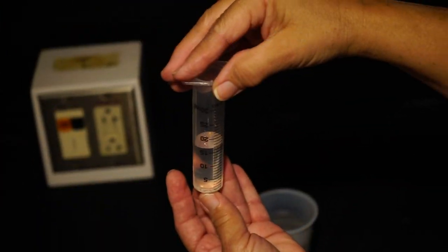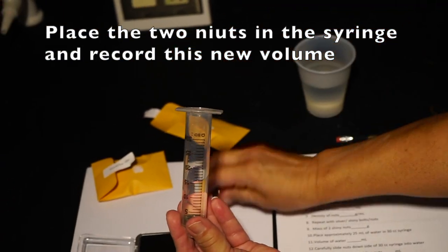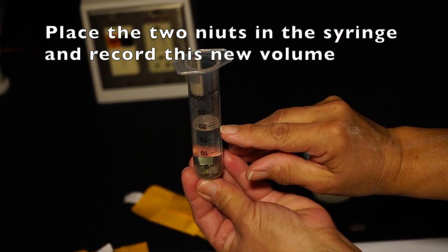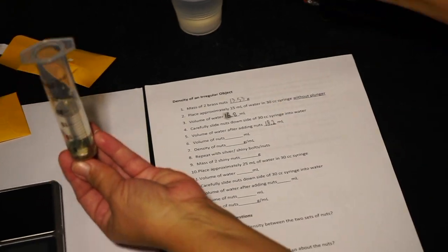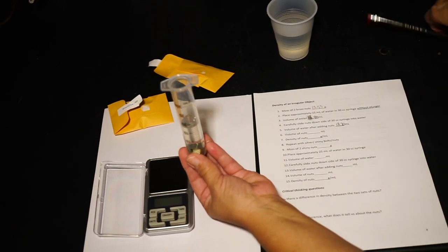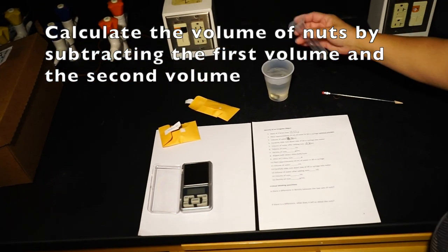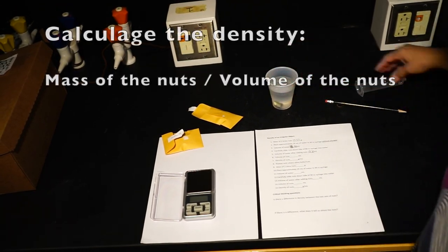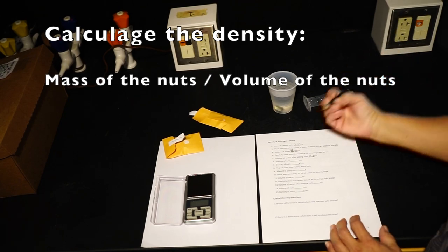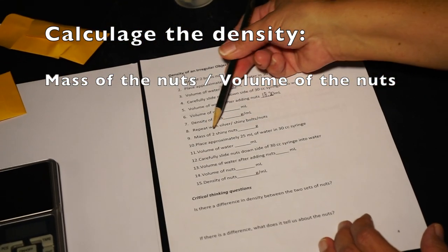Once you're confident in your measuring abilities, record the amount of water in your syringe. Then place two nuts in the syringe and record this new volume exactly. Determine the volume of the nuts by subtracting the first volume measurement from the second. You can then calculate the density of the nuts by dividing the mass of the nuts by the volume you just calculated.